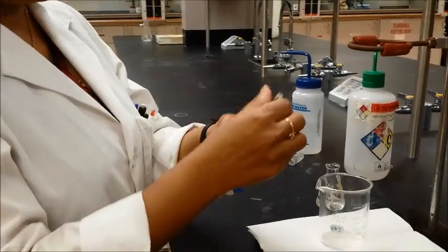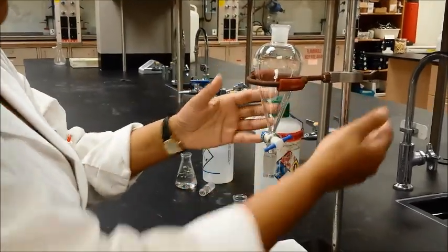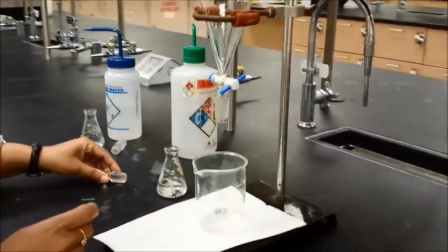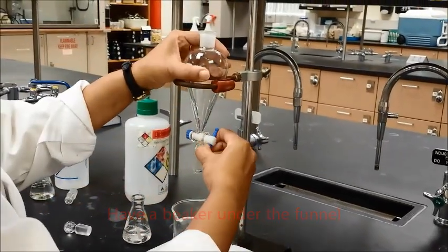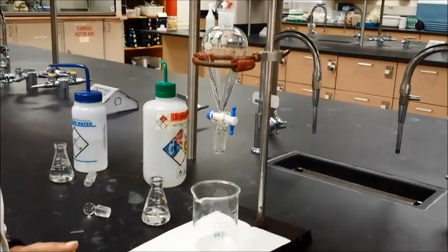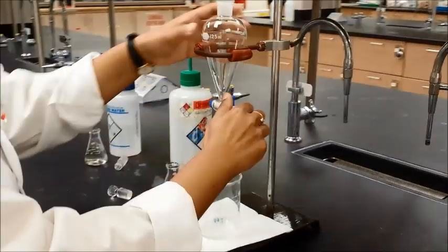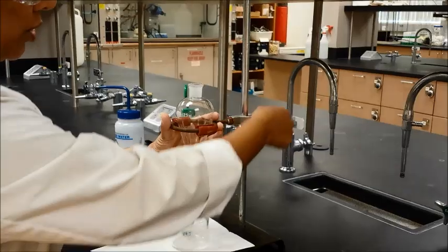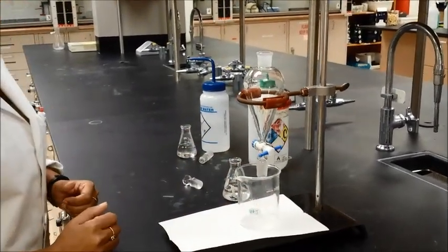What you will do is take your separatory funnel without the stopper and place it on the ring clamp, and then make sure that you have something underneath it. It's a very common mistake to keep the separatory funnel on there and forget, and then when you start pouring things in there, everything comes down. So you want to make sure, first of all, you have something underneath it. Second, make sure it's closed. Third, make sure it is low enough that things don't splatter out of it.